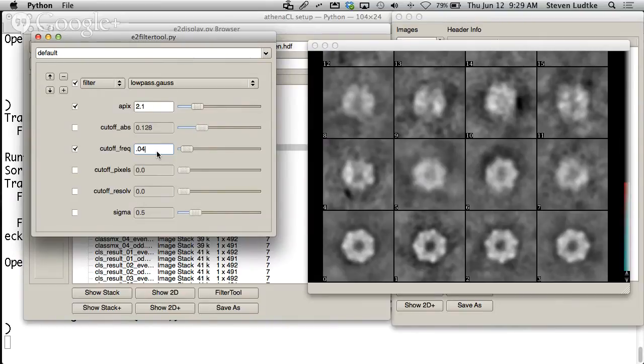And what you'll be left with is the sum of the squares. It's the RMS, the root mean squared average of the resolutions, at least if you're using Gaussian filters.